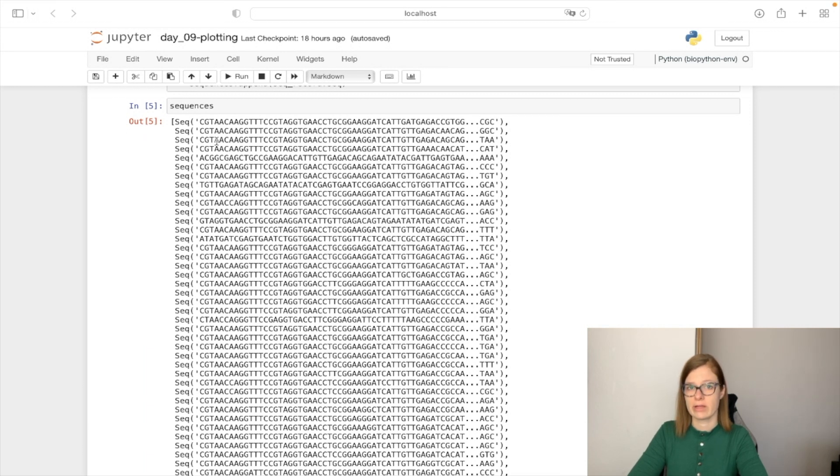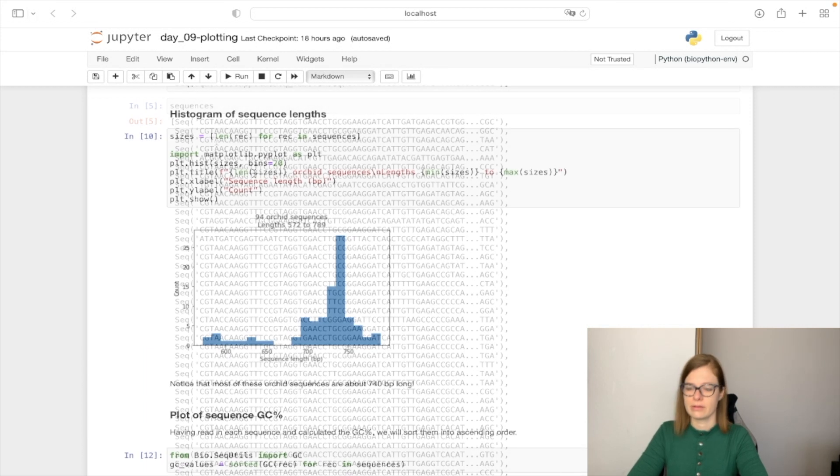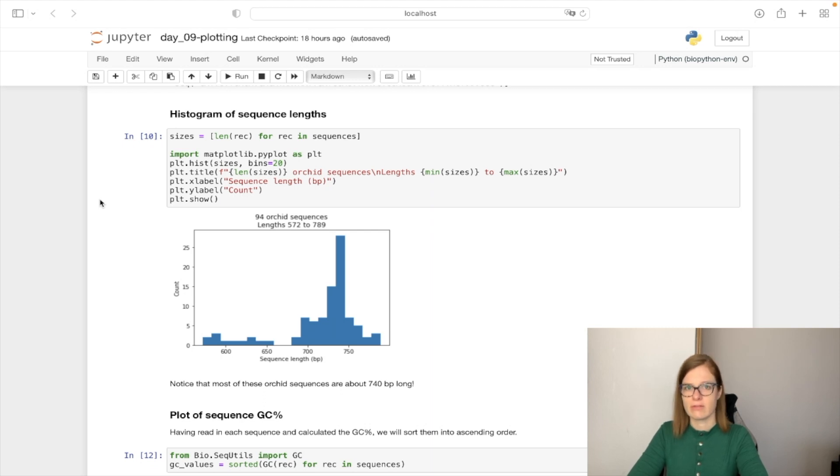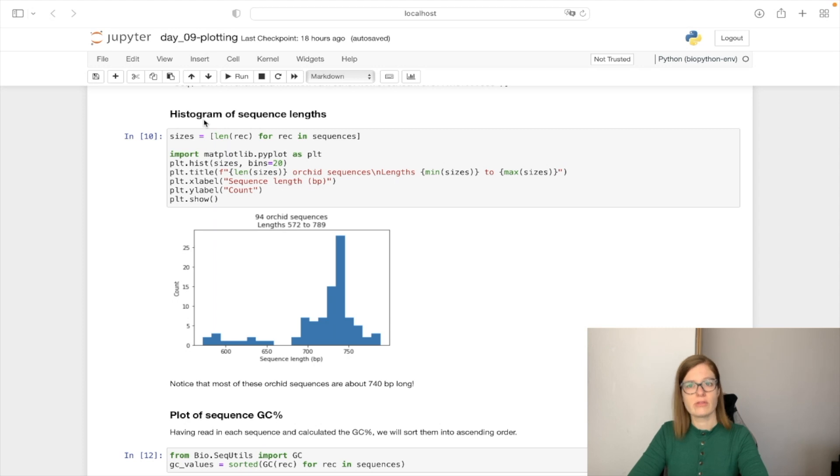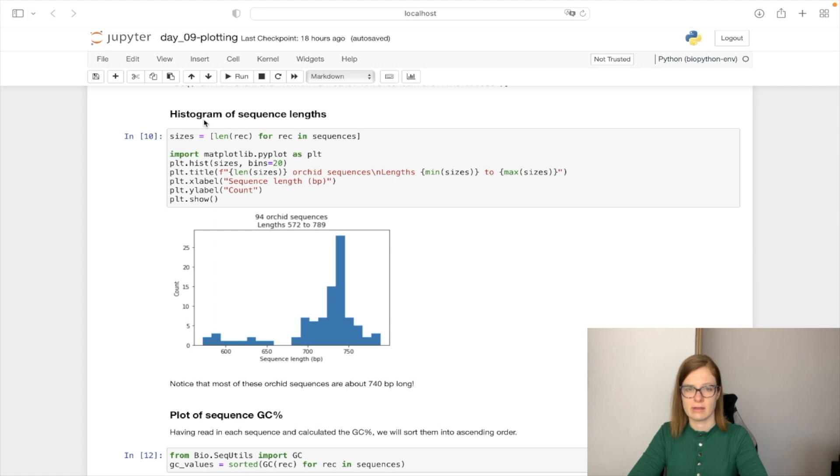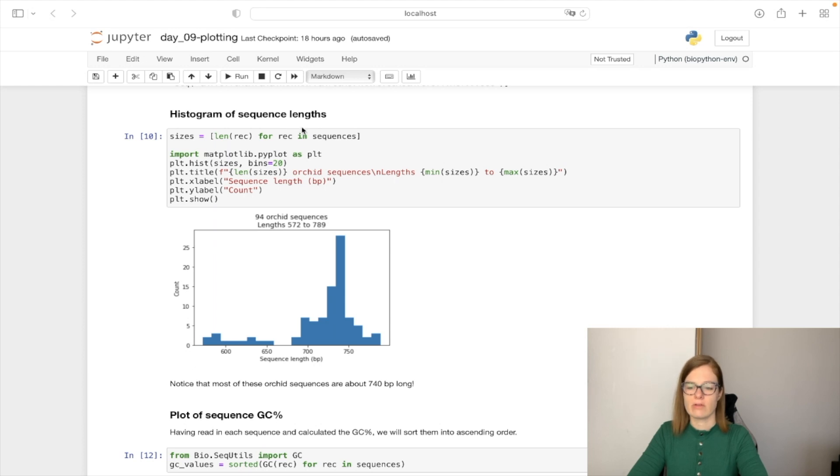Next what we can do is plot the histogram of sequences length. Before we start plotting, first we need to calculate the length of each of the sequence in our sequences list. We can do that by looping over the sequences list and for each of the sequences we will calculate the length of the sequence.